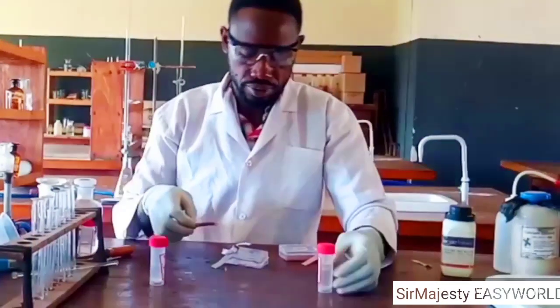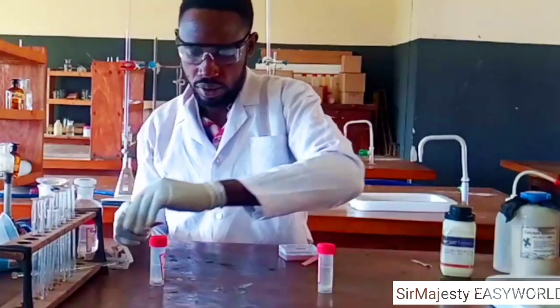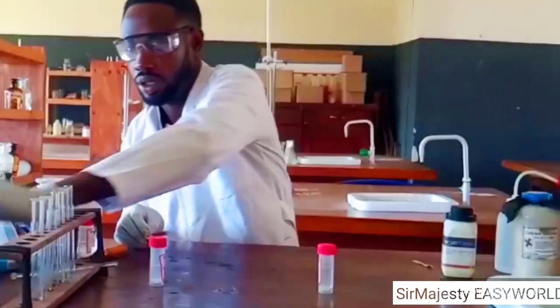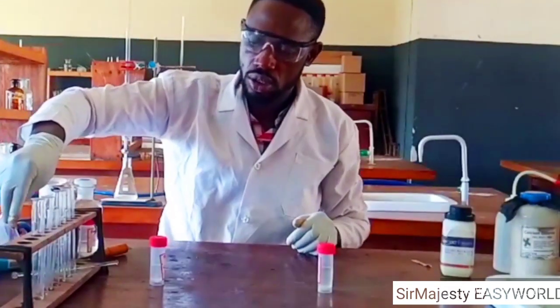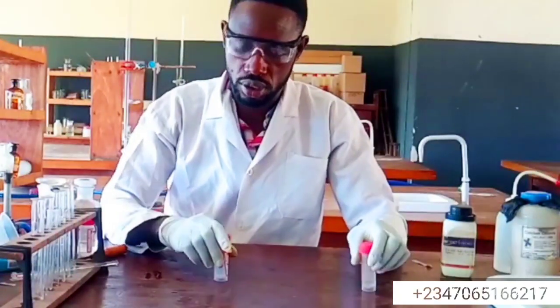Okay, then the next thing we might face is, each of the solutions E and L, you might be told to divide into 3 or 2 portions.